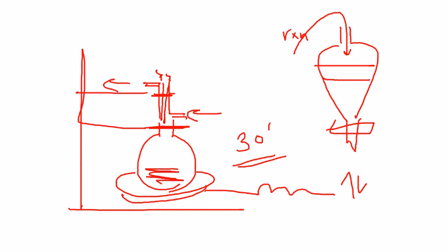Just in general, unless you have hydrocarbon which contains heavy atoms like chlorine or bromine, consider hydrocarbon type compounds to weigh less, and so the density is going to be lesser, and that should be your topmost layer.